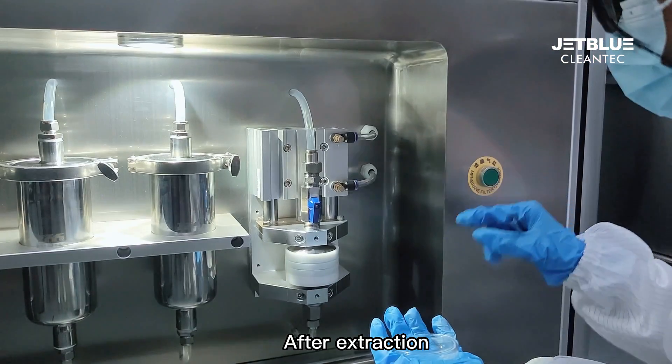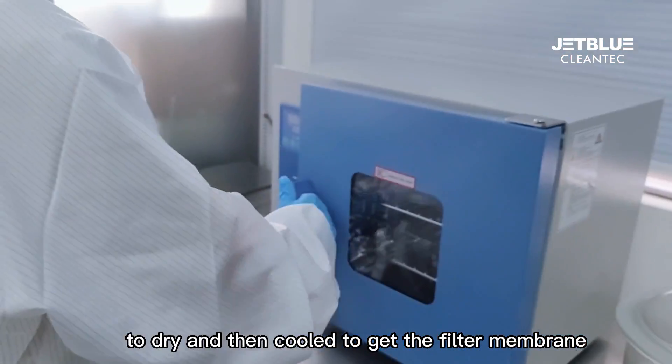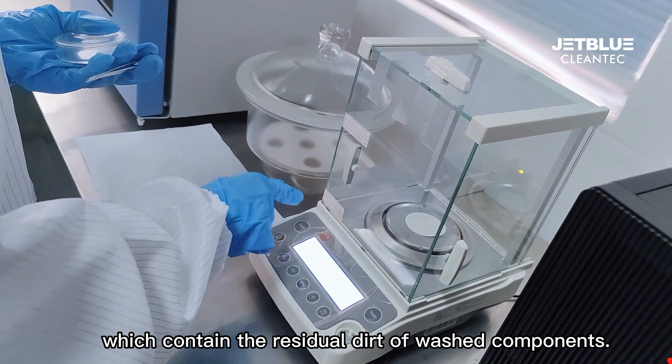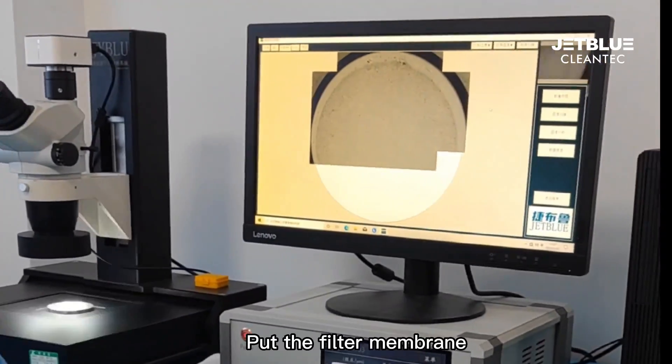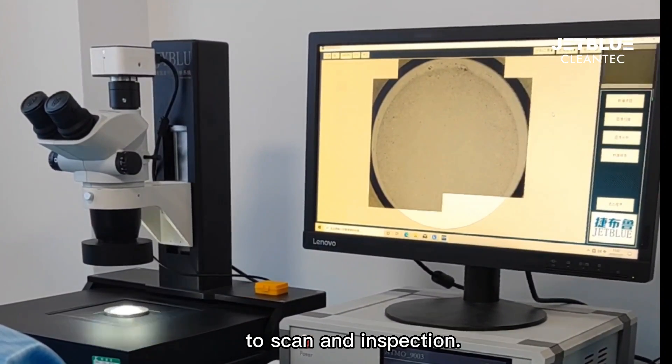After extraction, take out the filter membrane and put it in a drying oven to dry, then cool it to obtain the filter membrane containing the residual dirt of the washed components. Place the filter membrane on the microscopic scanning platform to scan and inspect.